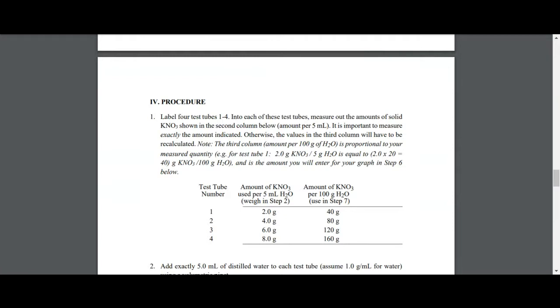We can't keep adding and keeping the temperature constant, at a high or low temperature, and keep adding, because it's going to be hard to control the temperature. So if you dissolve it and then lower the temperature, as soon as you see particles coming out, you say this is the temperature at which it gets saturated. So that's the highest value that you can dissolve at that temperature.